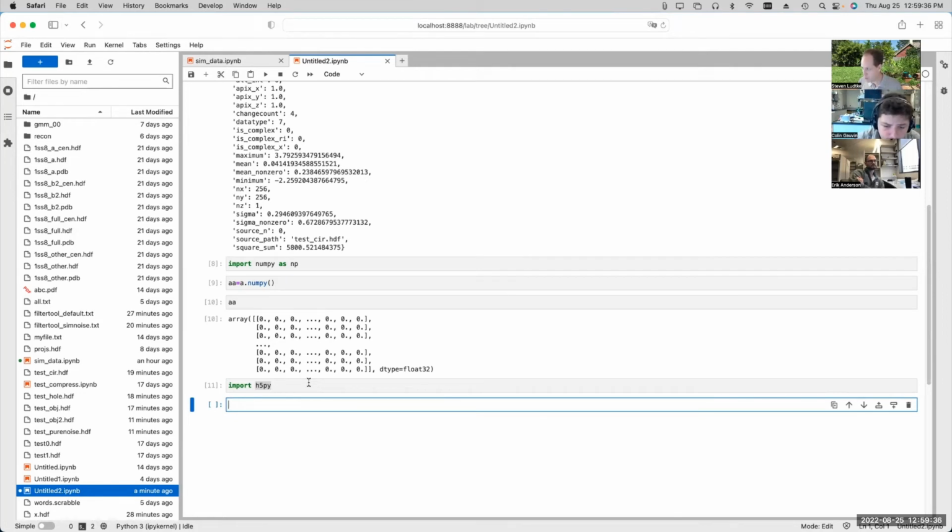And you will not be able to open those H5 files as if they were image objects in EMAN, because they aren't. They're a whole set of TensorFlow tensors. We might be able to come up with some way of interpreting them as image objects of different sizes, but at the moment you can't read them. So that use of HDF5 files is another valid use, but it's also not an EMAN2 compatible use.